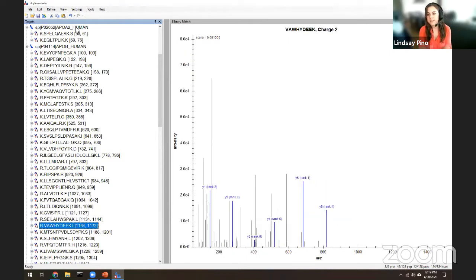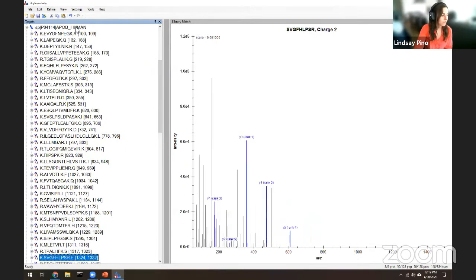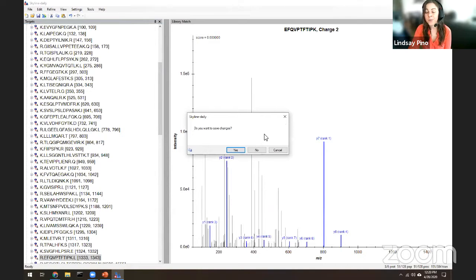So we started with zero prior knowledge, just the protein sequence. Now we have downloaded some prior knowledge from a repository, and made this spectral library to look through what other people have seen. Now, finally, let's imagine the best case scenario: we have either ordered protein standards for these 6 proteins, or we've made expression vectors for each of these 6 proteins and expressed and purified protein standards just from bacteria.